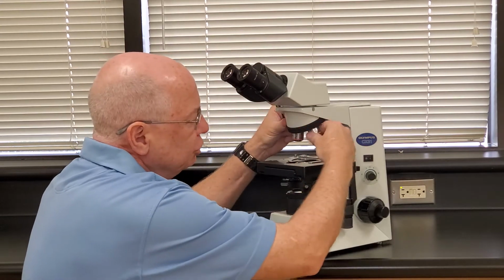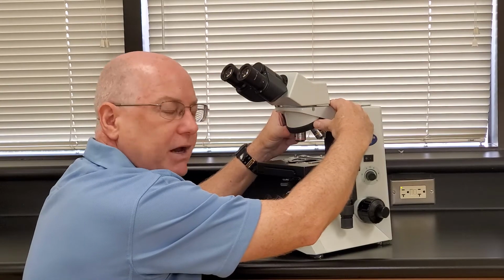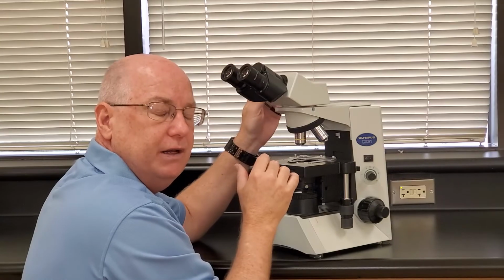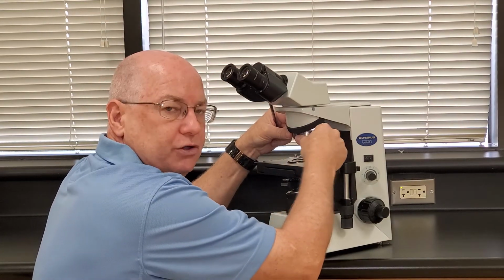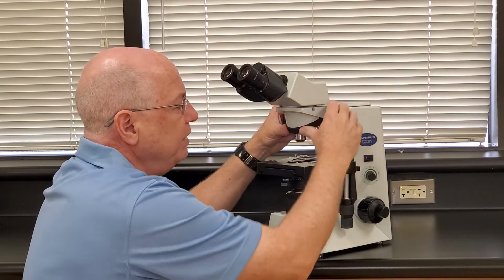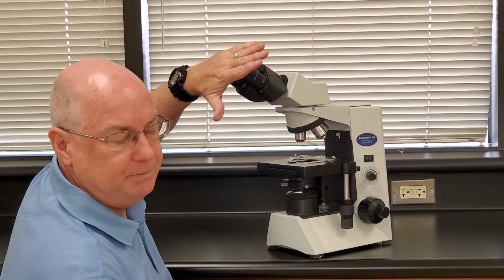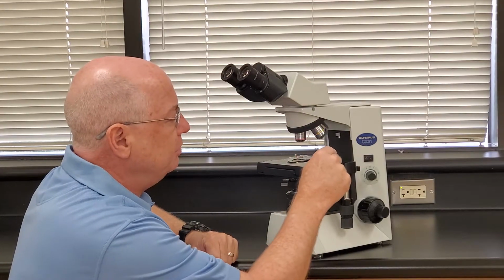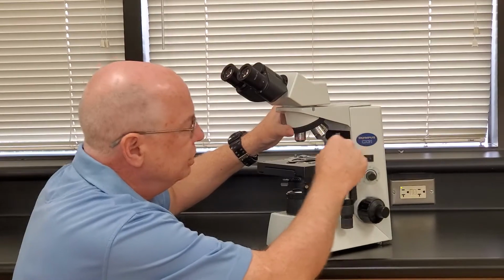They actually unscrew and screw in, and if you unscrew one, it's a little too far off. And the microscope is set up that when I go from one to the other, they should be pretty close in focusing. But if they're unscrewed, they will not focus properly. So please don't ever grab the objectives. That's why we have the revolving nose piece. So, oculars or eyepiece, revolving nose piece, low magnification, middle magnification, and high magnification objective, or in general, they're called objectives.